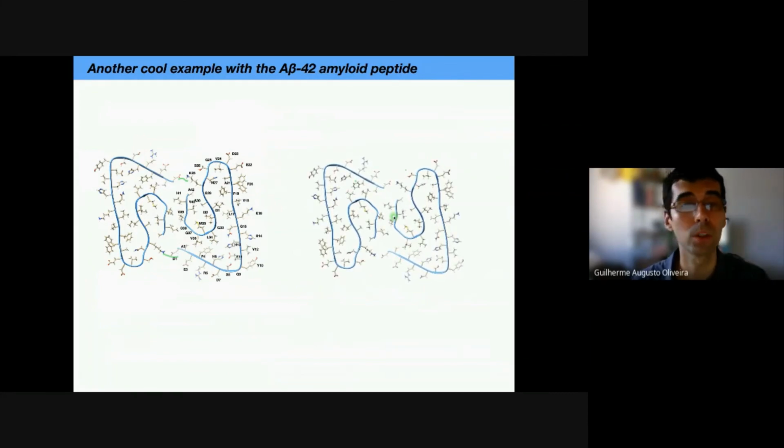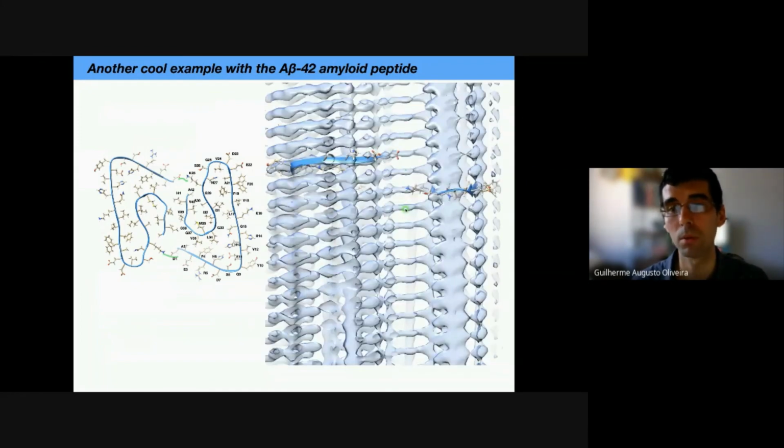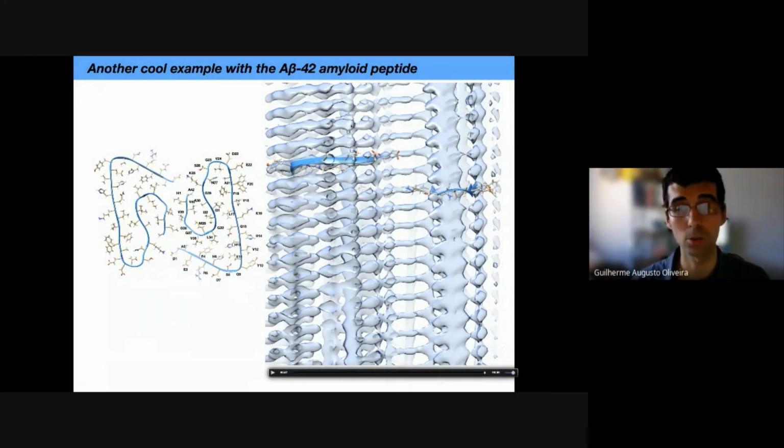So the salt bridge is forming all over the axis. We can imagine that if you want to dissociate these protofilaments, you can just play with, for example, ionic strength. You can see that the salt bridge is not forming like this at this distance. They are forming with this protomer in here. This is the density for the lysine, and this is the other density forming the ion pair. It's all perpendicular to the filament axis, though. It's pretty cool to have this type of detail and understand the forces that keep the filament together.